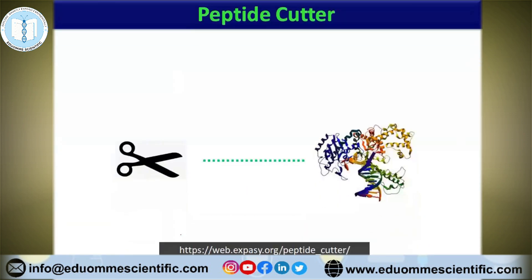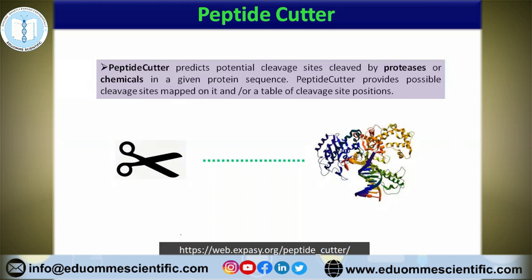Today's session will be on Peptide Cutter. For those who are beginners to this platform, I would like to briefly explain what this tool is and who requires it. Mostly, if you are from biochemistry, structural biology, computational biology, or molecular biology backgrounds, you might require work related to proteins and peptides. At many stages, we have to cleave these peptides and proteins for experimental purposes. So if you want to see what and where your peptide and protein can be cleaved by proteases and chemicals, you can use this ExPASy-based tool called Peptide Cutter.